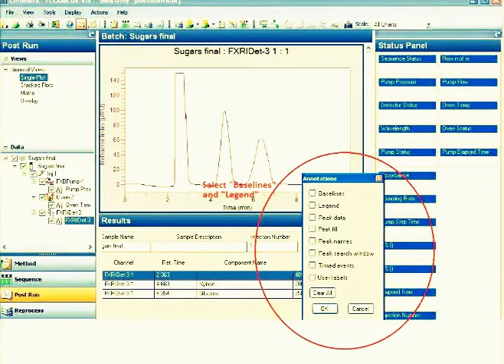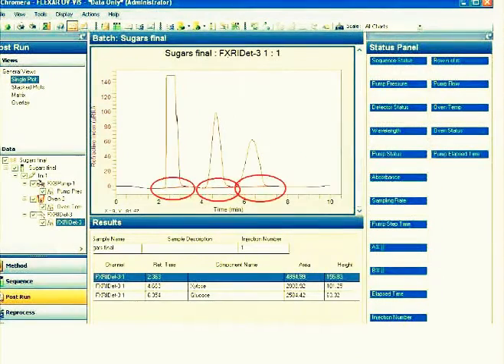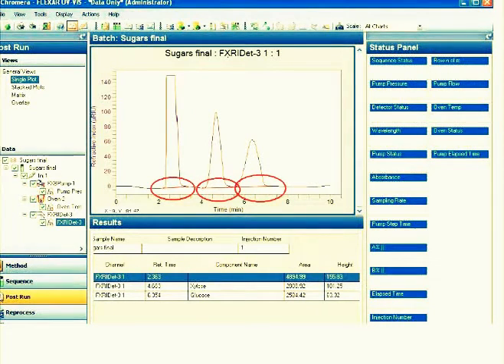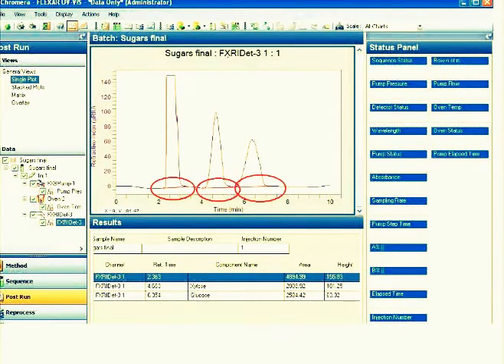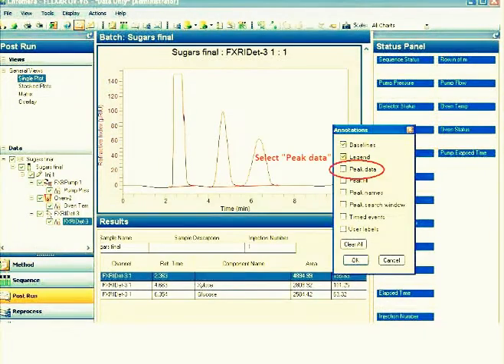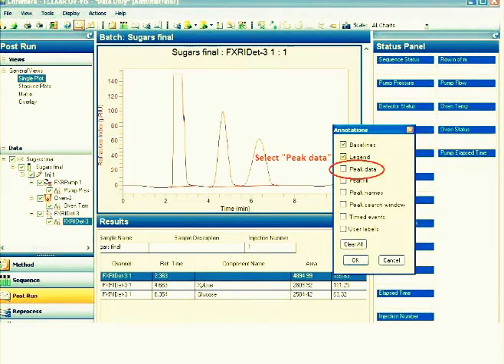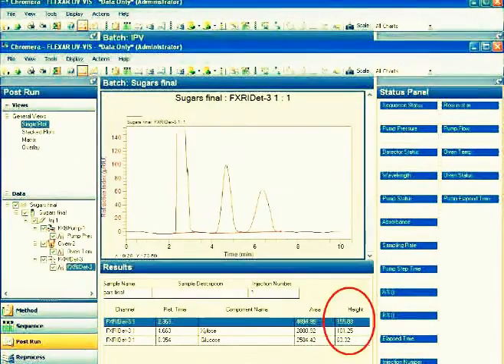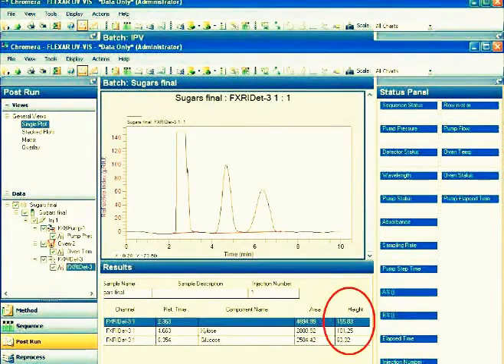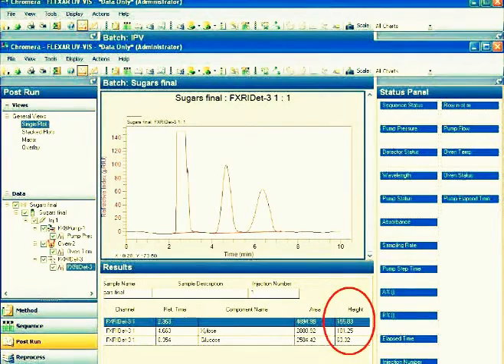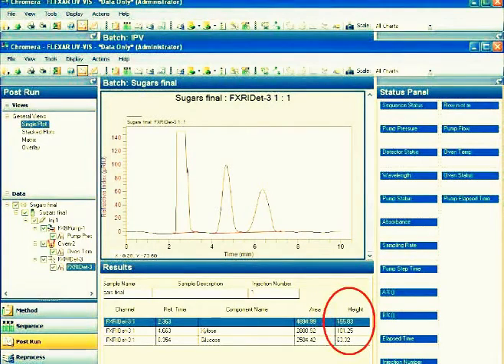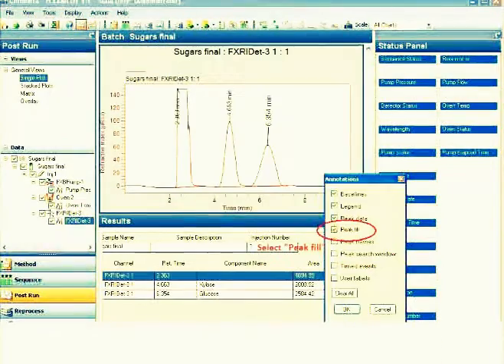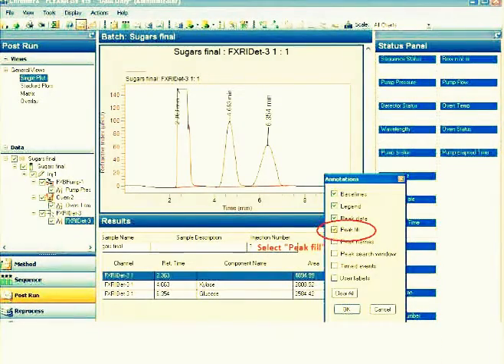Let's first click on baselines and legend. As you can see, a baseline has been established for each of the peak. Then for the peak data, click on it. Automatically, it will register the peak height.